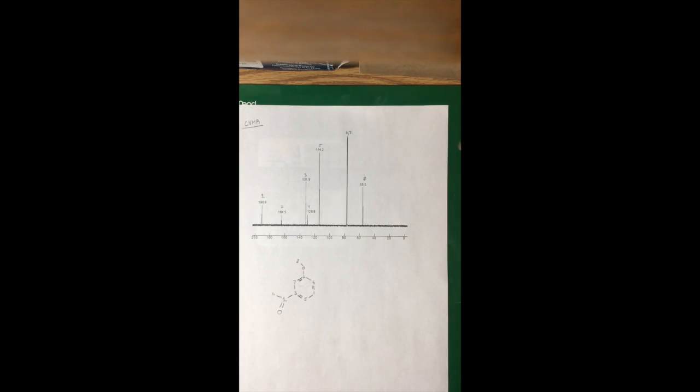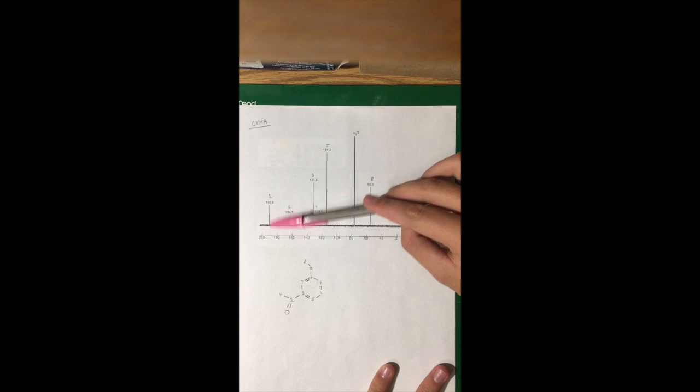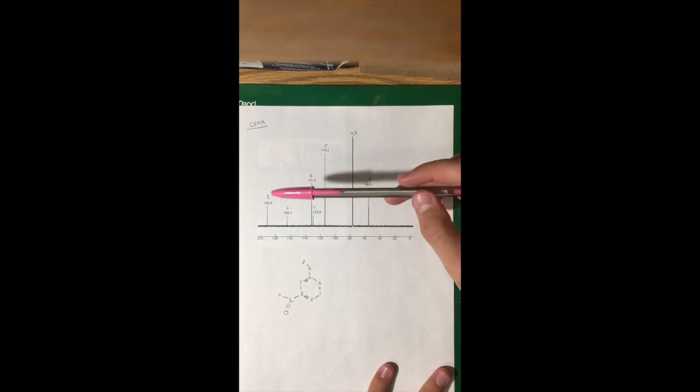Lastly, we will look into carbon NMR. First, we have this 1, which is correlating to the aldehyde carbon, the carbon bonded to the aldehyde and the 1 hydrogen coming off of it.